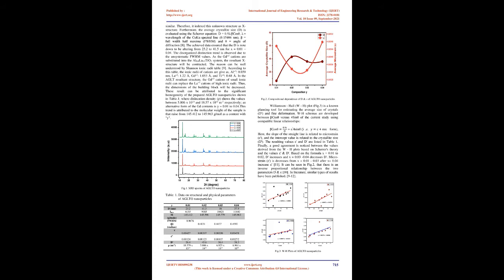With the help of a magnetic stirrer, the precursor mix was blended at a constant stirring speed of 420 rpm. After some time, the white mixed nitrate solution was obtained. Finally, the solution was moved to a Teflon bowl of 300 ml capacity. Then the Teflon bowl containing the solution was put into the stainless steel autoclave. To carry out the hydrothermal reaction, the autoclave was kept inside the hot air oven for 8 h at 150°C.